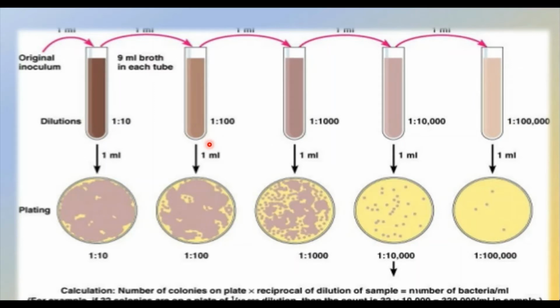1:100. To the petri dish containing pre-solidified medium, 1 ml or 0.1 ml is added. So here 1 ml of this sample was transferred in and incubated at the desired temperature. Like this, from every dilution you are going to plate about 1 ml of the sample in the concerned dilutions. The number of colony forming units is calculated after the incubation period is completed. After incubation, the plates are going to possess these colonies, and those are counted.